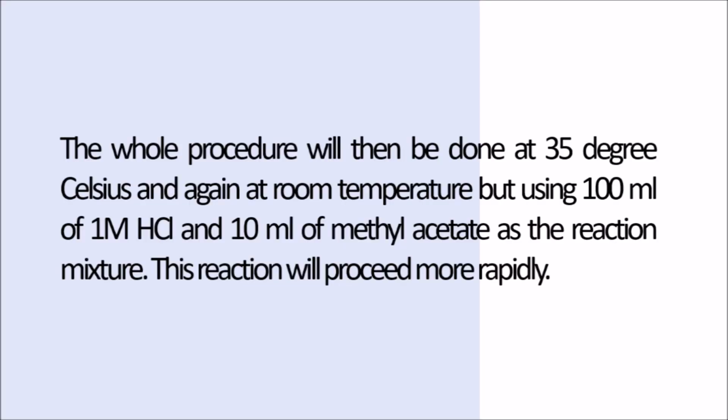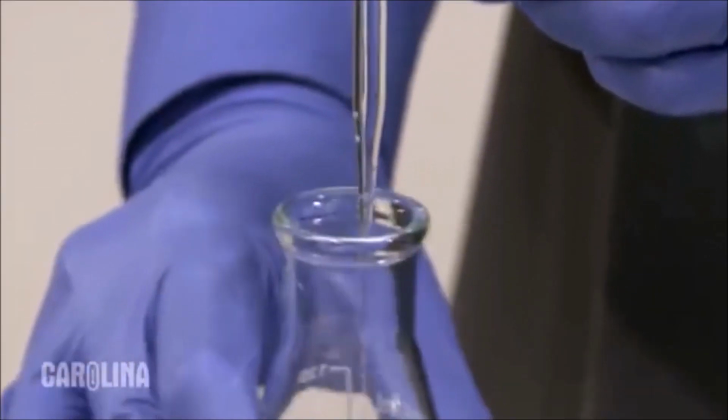The whole procedure will then be done at 35 degrees Celsius, and again at room temperature but using 100 milliliters of hydrochloric acid and 10 milliliters of methyl acetate as the reaction mixture. This reaction will proceed more rapidly.